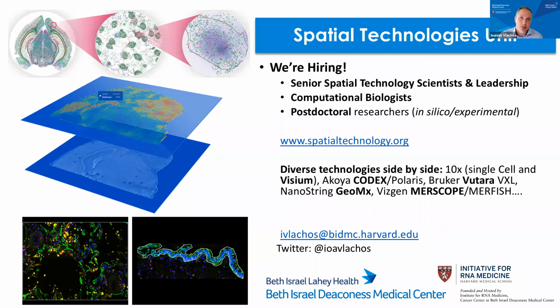So for spatial, mostly we were working with these approaches for bulk. We are now shyly bringing those to spatial. Our TCR work, we're bringing it into two assays currently for spatial. We have more years working with bulk, so it's relatively more straightforward if we have an idea how to implement it. Many times with spatial, we have to work with a technology developer and try to also change the prep or work with the assay in order to increase granularity there. But yes, there is definitely potential for bulk, coding, non-coding mutations, their effects. We have projects dedicated for that.